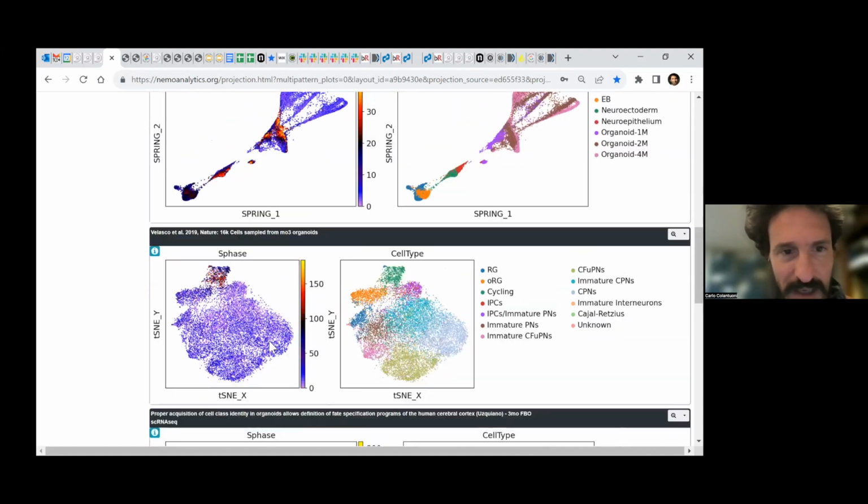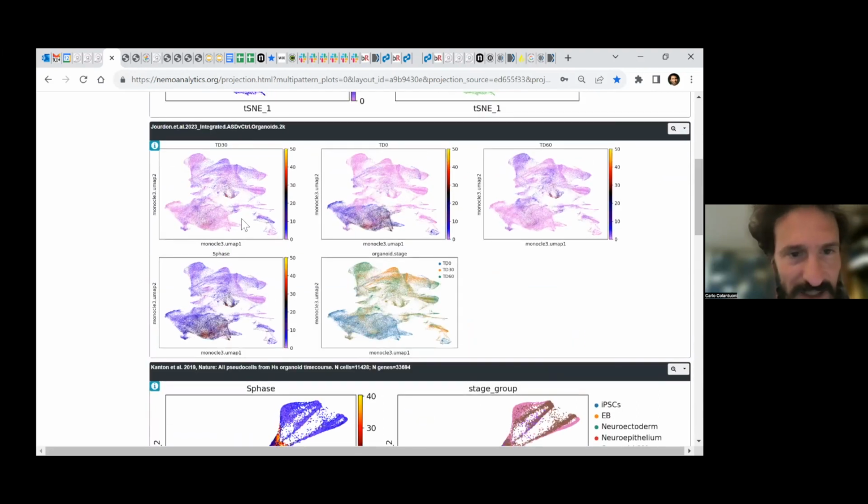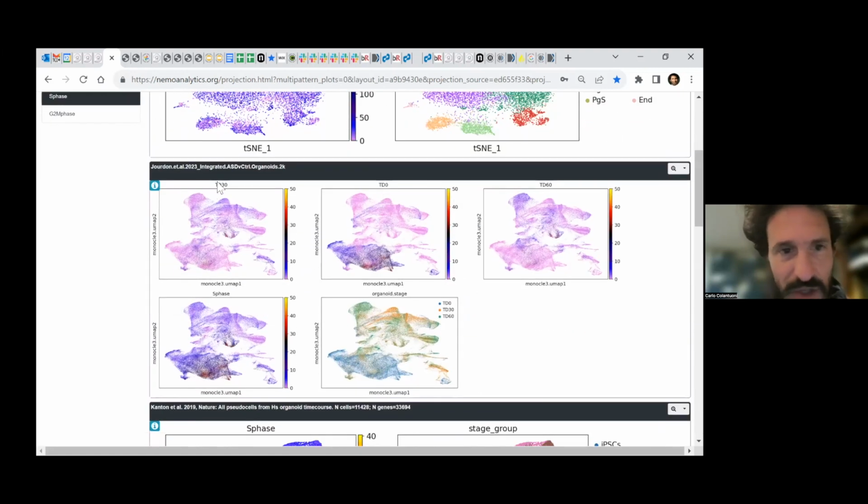But maybe, yes, here's Alex's data, which has loaded in the meantime. For some reason, it's changed the order of time on us here. This is time 0, where the large progenitor pool is cycling from S to G2M. And then at 60 and 30, there's this second population of cells that's cycling. It's at quite a different space. It'd be interesting to try to track down what that is.